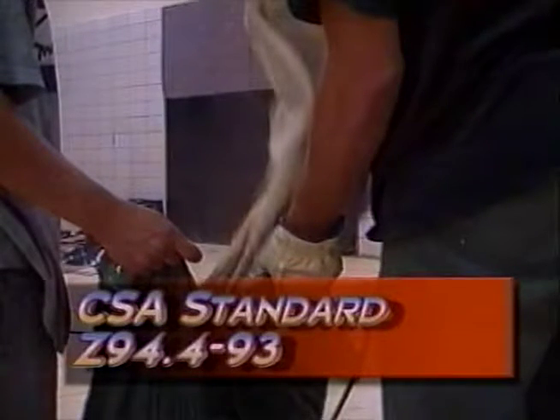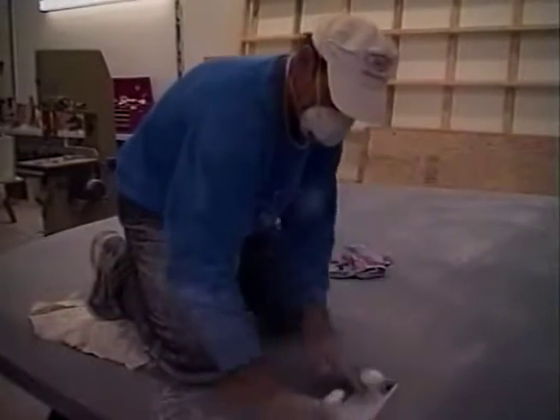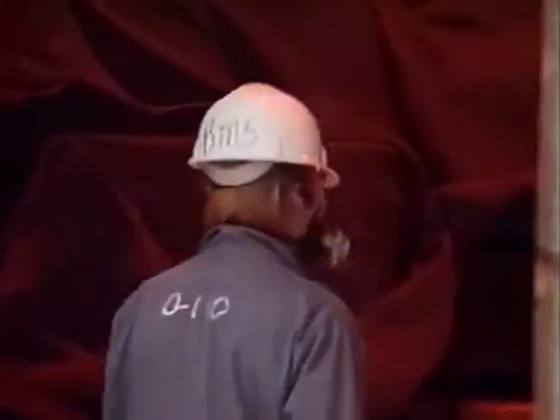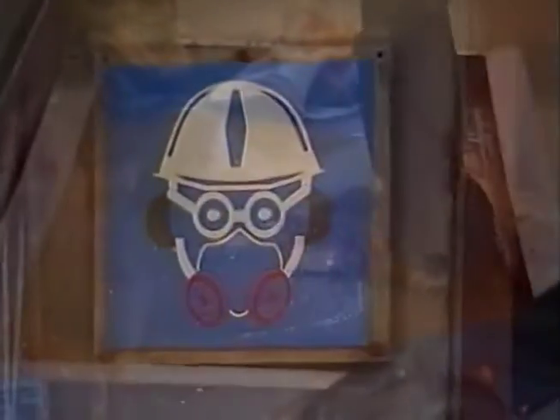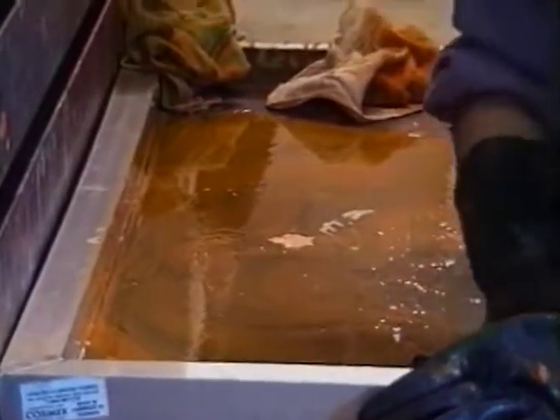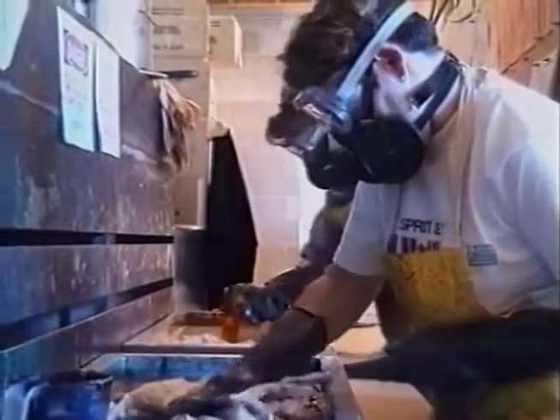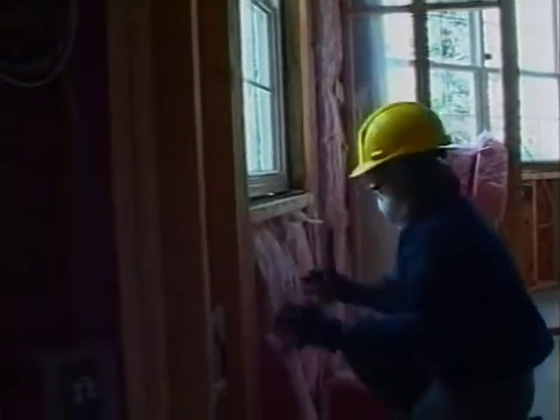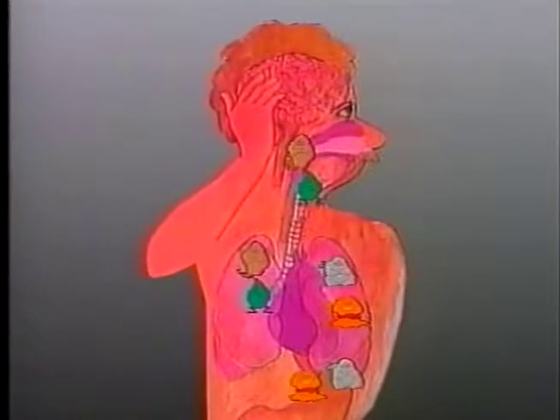The use of a respirator is required when contaminant concentrations are above the legislated maximum permissible levels, or when required by the employer. Workers may choose to wear a respirator when contaminants are below the legislated maximum permissible levels to further reduce their exposure. Respirators are an important part of personal protection in the place of employment. They are used to prevent air contaminants from entering and damaging the lungs or being transported by the blood to other organs.